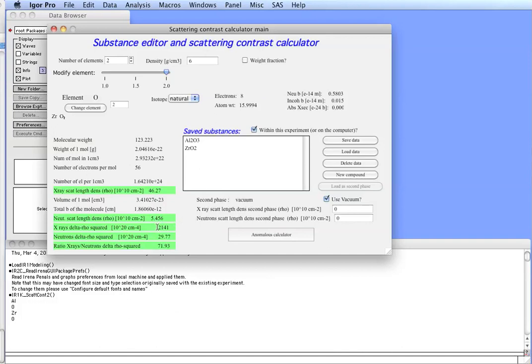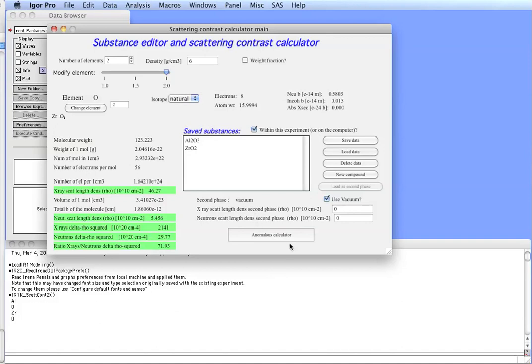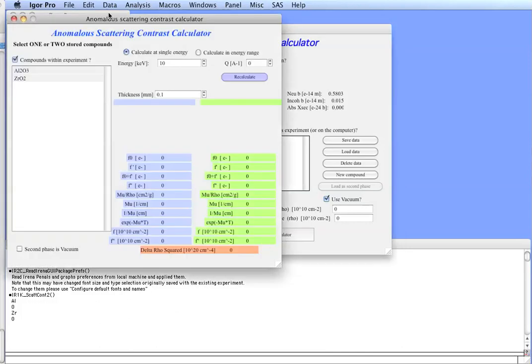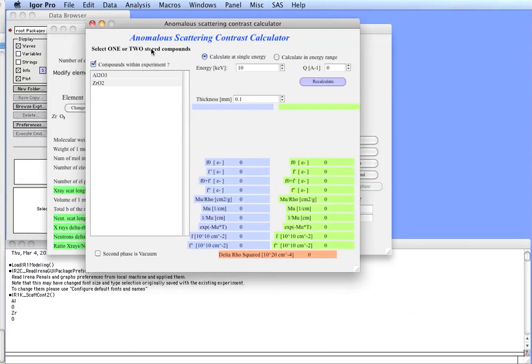So, with this calculator, you already have the usable contrast for most of the X-ray experiments, or all of the neutron experiments, assuming that you pick the right isotopes. Now, for X-rays, you may find it useful to be able to calculate parameters corrected for X-ray energy. So, let's hit anomalous calculator button. And that gives us anomalous scattering contrast calculator.